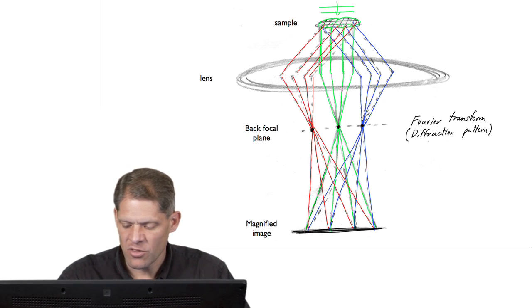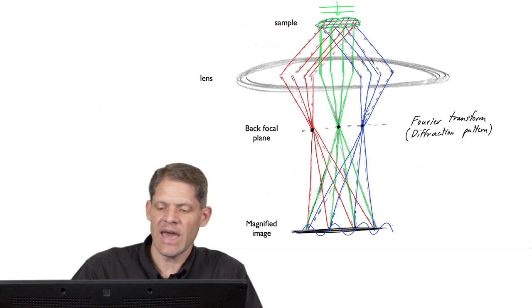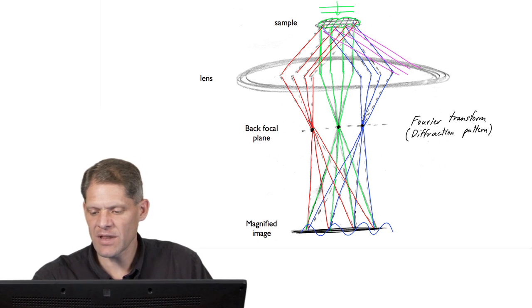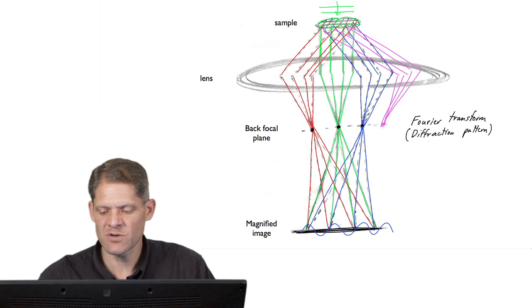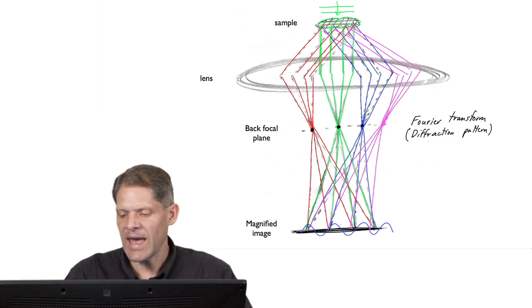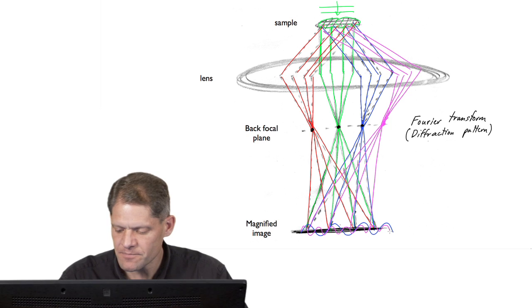So for instance, the blue scattering might represent a sine wave of a particular frequency. Scattering at a different angle, say scattering at a higher angle, here would be collected at a point further out in reciprocal space away from the origin, but would still carry through and add its information on the image plane. It might represent a wave that's oscillating much more rapidly.